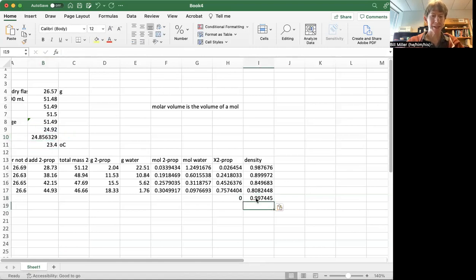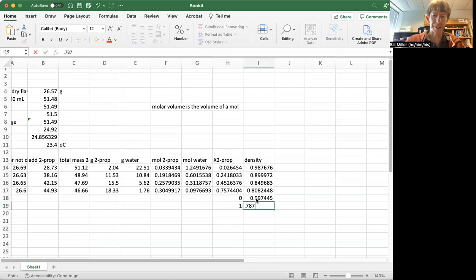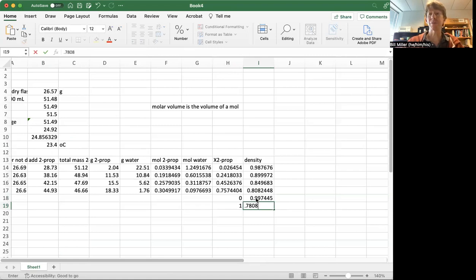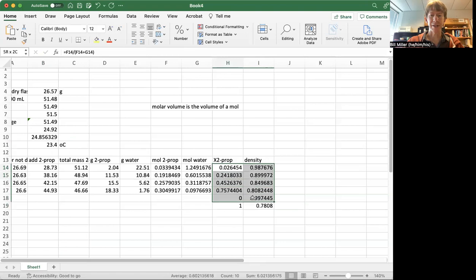And then one, I just happened to remember, because I was working with it before, 0.7808 is the density of pure 2-propanol. So I'm going to graph these six points.